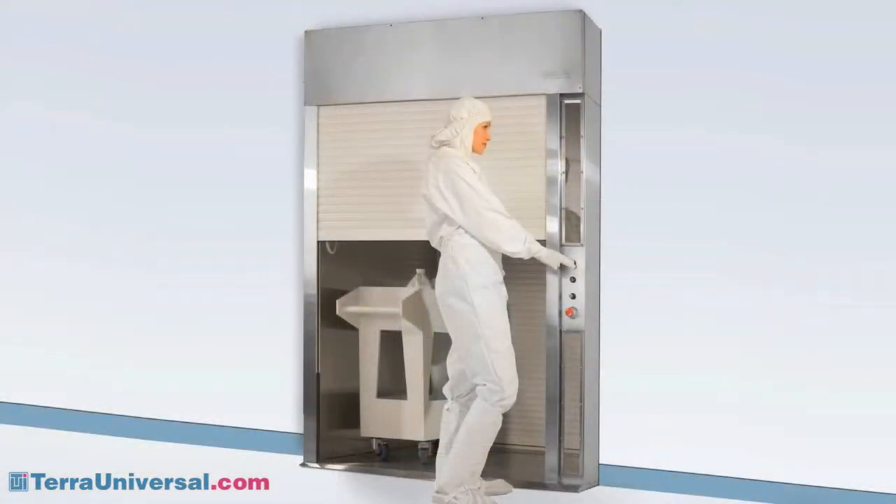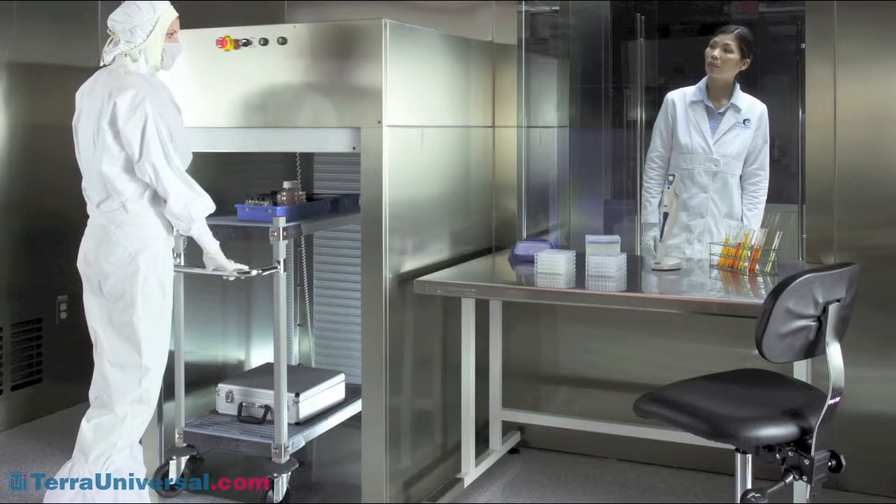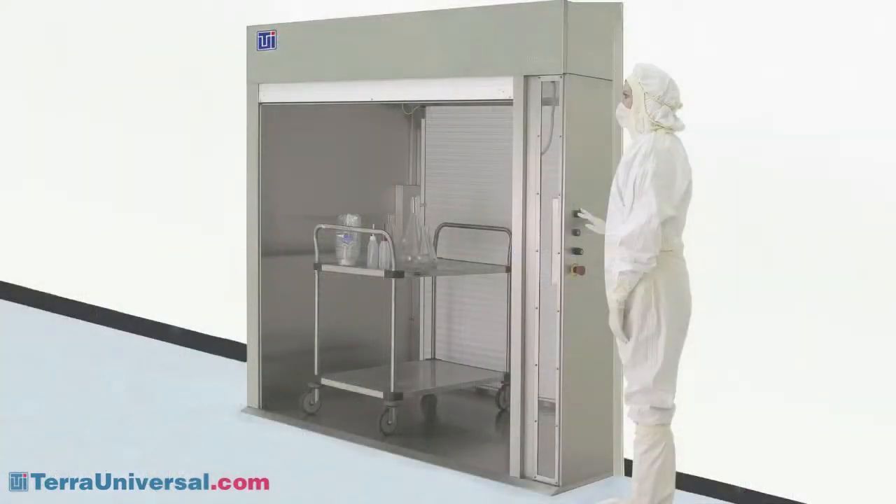Available in three sizes, the Roll-Up Door Pass-Through features dual ramps and roll-up panels made of powder-coated insulated aluminum. The stainless steel housing and dissipative PVC viewing window are easy to clean and sterilize.